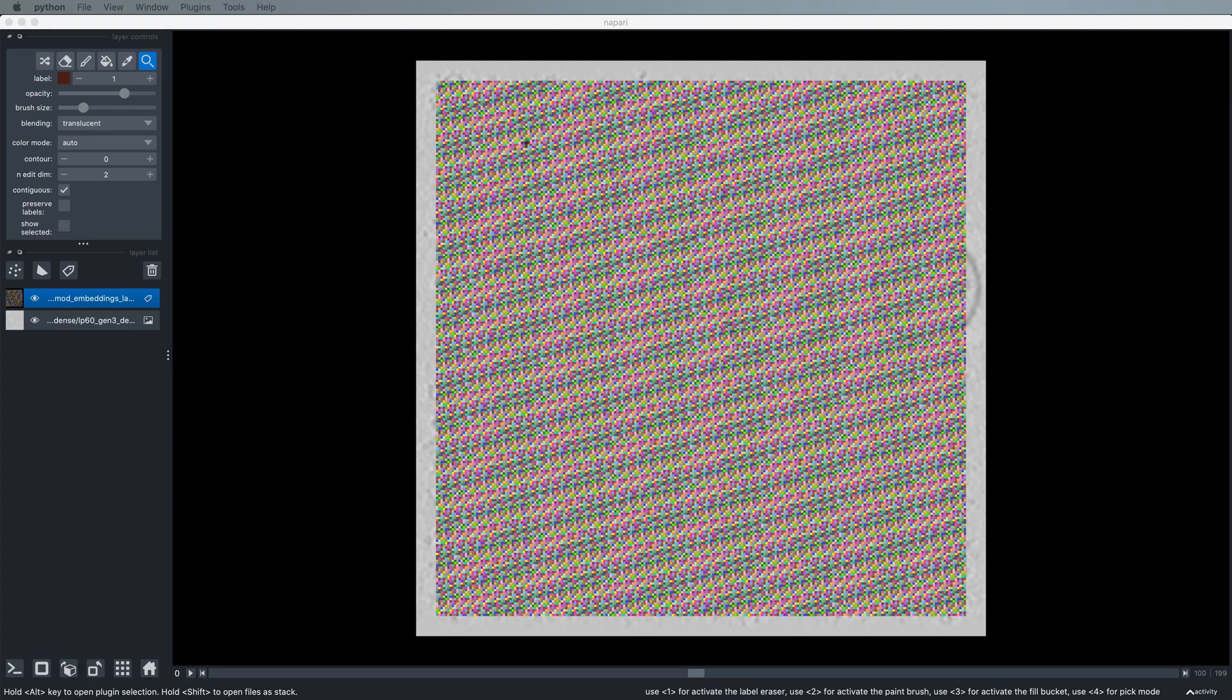Welcome to this quick video tutorial for the TomoTwin clustering workflow. This video tutorial is meant to stand alongside our written tutorial on the TomoTwin Read the Docs, and demonstrate some of the features of our Napari interactive clustering workflow that allows you to pick multiple proteins of interest in your tomograms without having to provide a single reference for any of the proteins you'd like to pick.